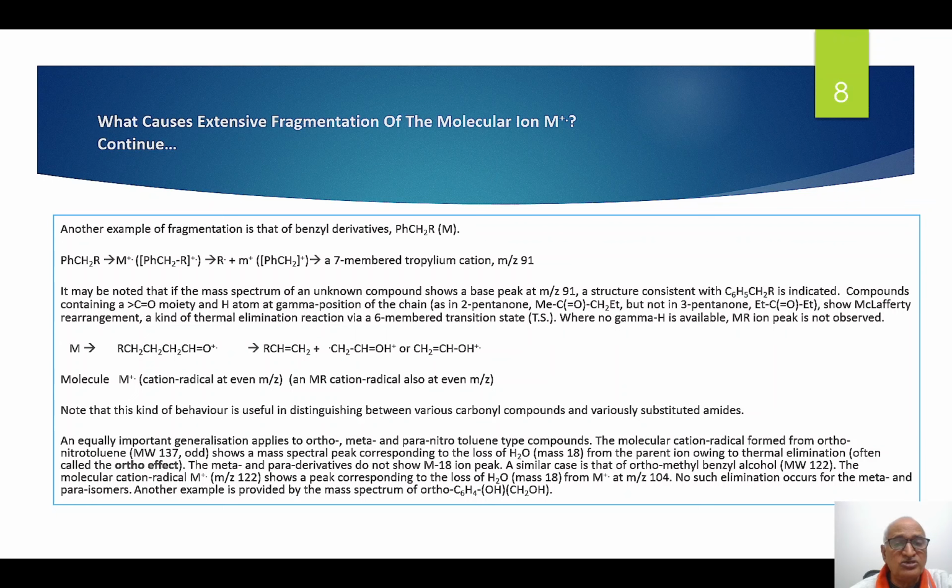Again, a thermal elimination reaction. Removal of a water molecule from the molecular cation gives a peak at even mass number. Thus, we can distinguish between ortho substituted nitrobenzene and meta and para substituted ones.